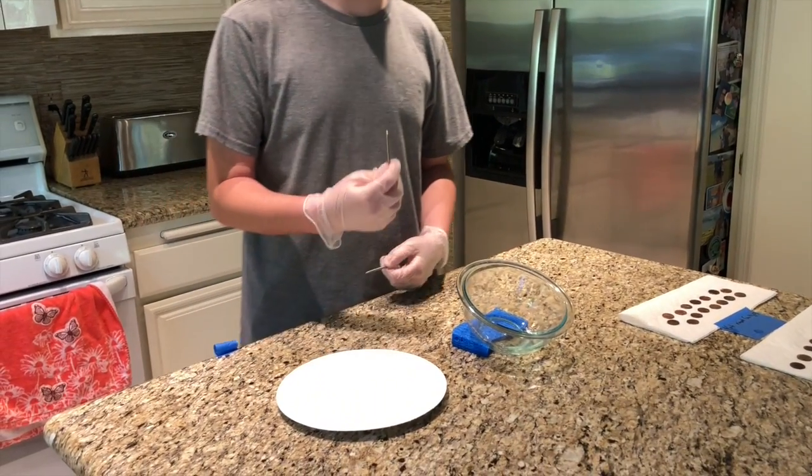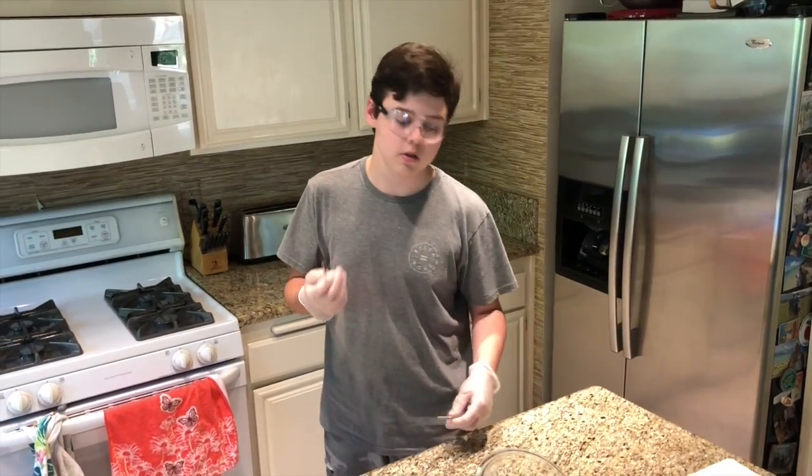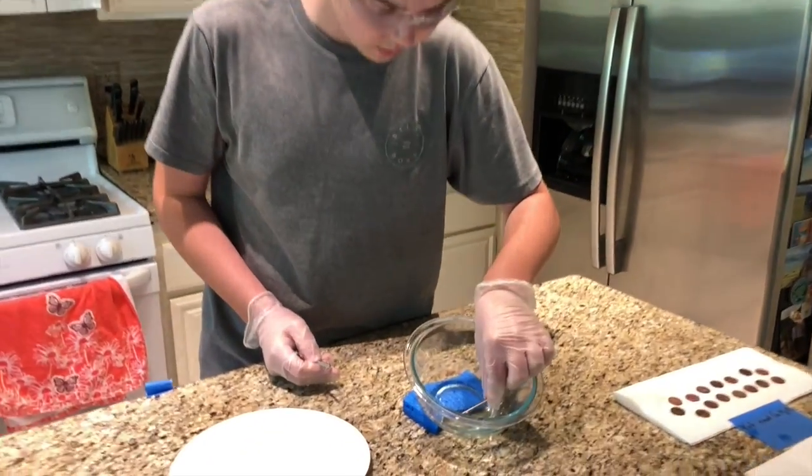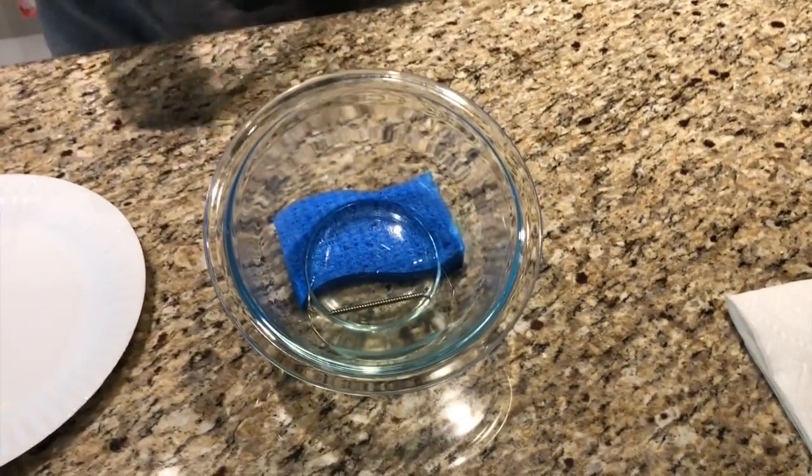We're going to hope that the copper ions plate these nails. And just like with the last experiment, we're going to put one of these half in and one of these all the way in. So let's do that now. And we're going to leave these to set for 10 minutes.